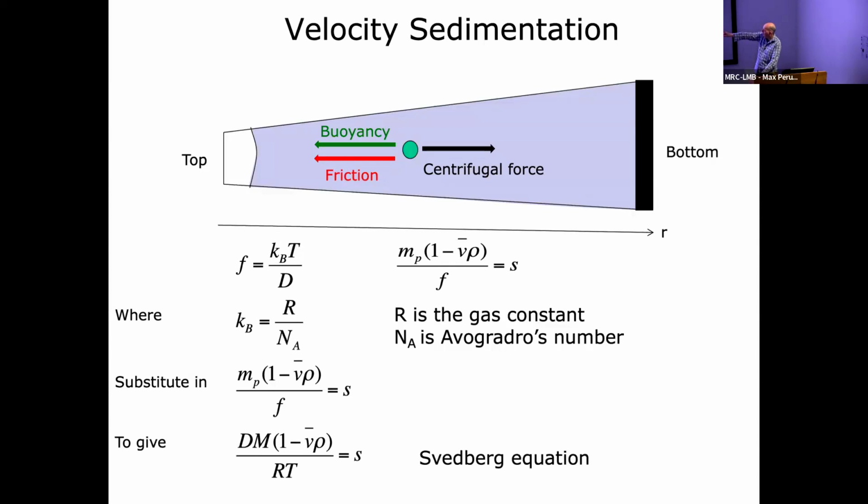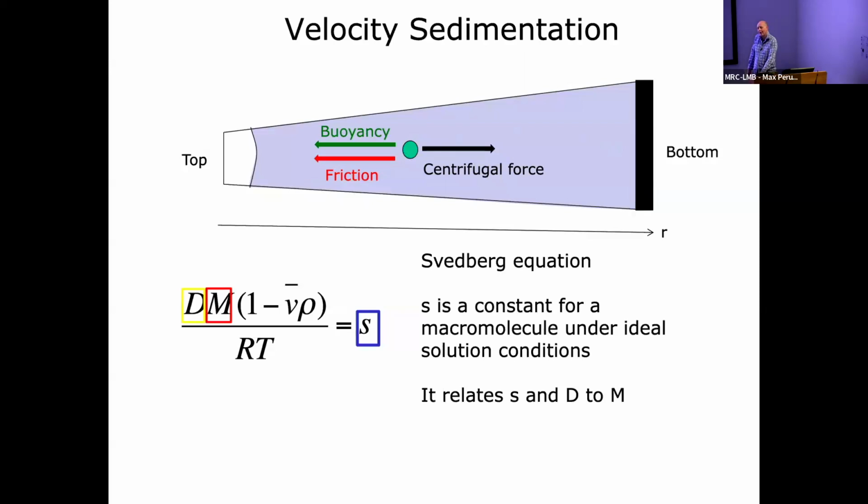So that's going to be relating the S value against the temperature, the gas constant, the mass, and the diffusion constant as well. So can we solve that equation for everything, going through how things move?